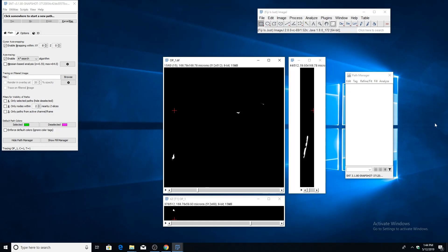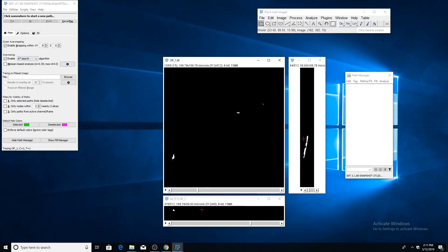Before we start tracing, it's generally a good idea to turn on the Hessian-based analysis, which will improve the quality and efficiency of the A-star search algorithm by filtering the image for tubular structures. There are only two parameters that we need to specify. One is the Sigma, which is the standard deviation of the Gaussian kernel which smooths the image prior to the tubeness filtering.